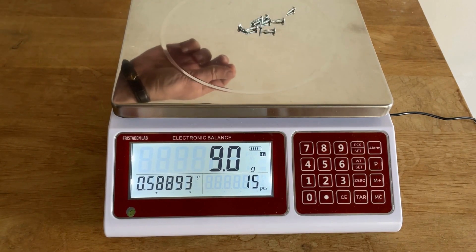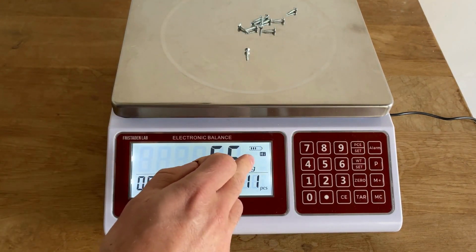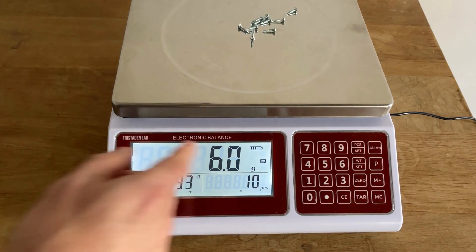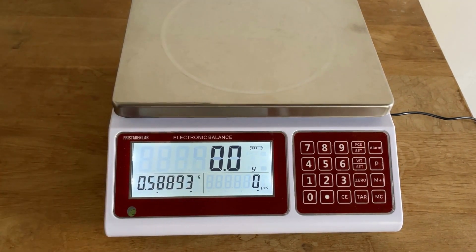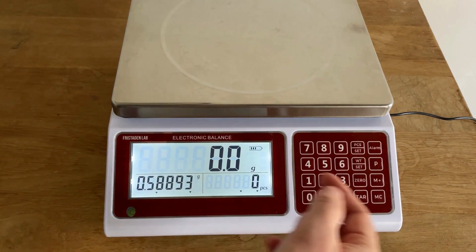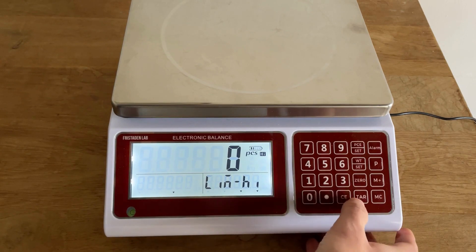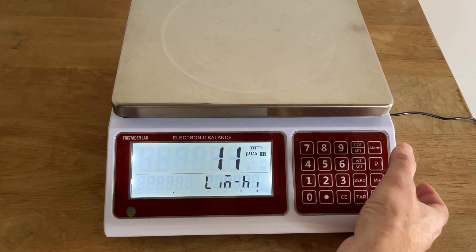Enter the lower bound — 5.5 — and press alarm. Place 10 units on the scale and it displays 'OK.' If you add enough to reach 6.5 it will go 'High,' and if you remove pieces down to 5.5 it goes 'Low.' This confirms whether you have the correct inventory count in a bundle. You can also set the alarm by piece count — go to alarm and press zero to switch to pieces mode.